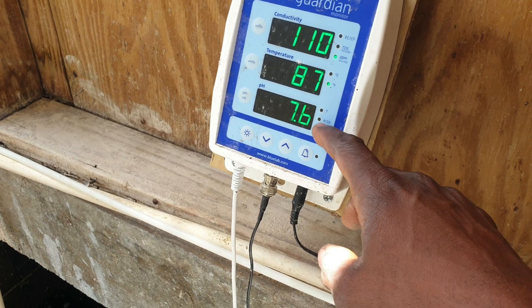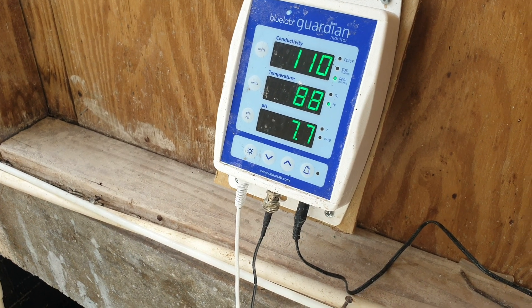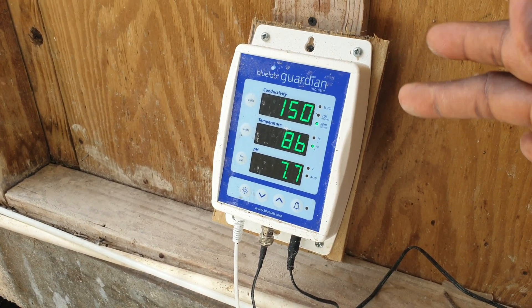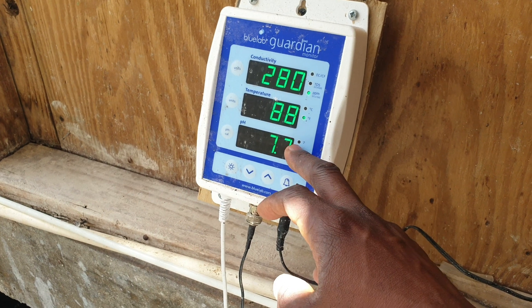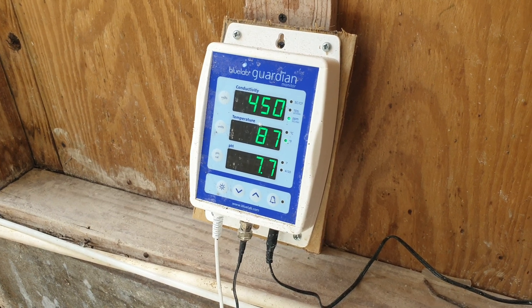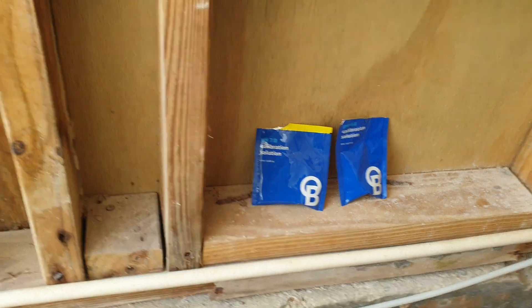The pH LED indicators are blinking, as you can see — that shows it needs recalibration. As soon as you start seeing this blinking, know that it needs to be recalibrated. The conductivity comes factory calibrated, so you only need to calibrate the pH probe. When calibrating the pH probe, they recommend putting both the pH probe and the conductivity probe in the solution — the pH 7 and pH 4 Bluelab calibration solution.